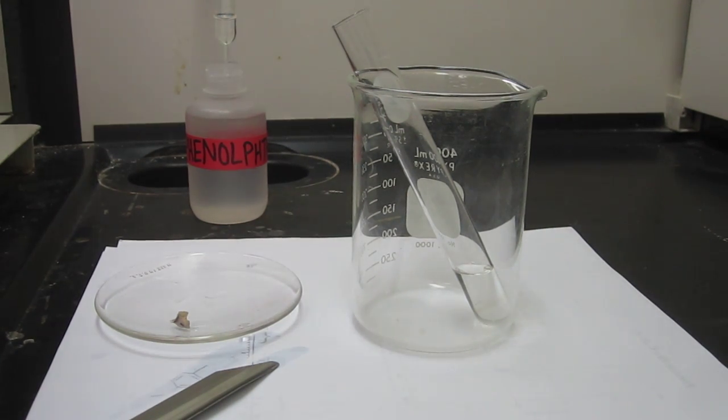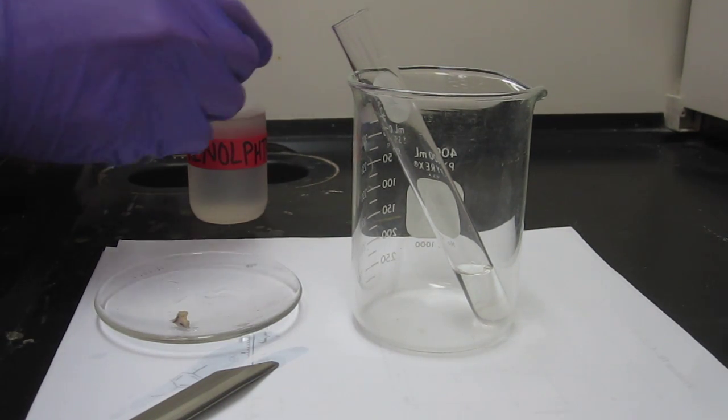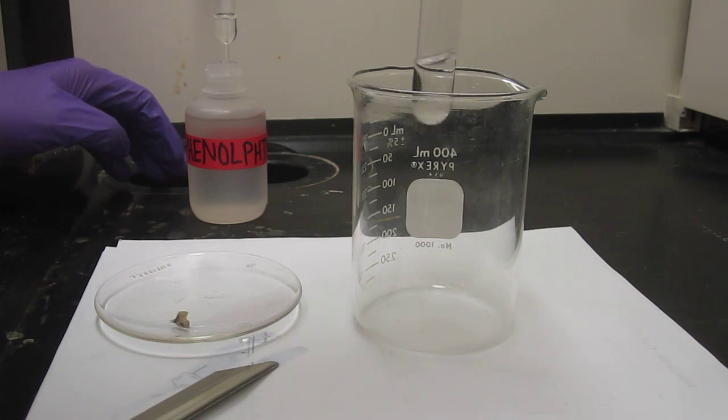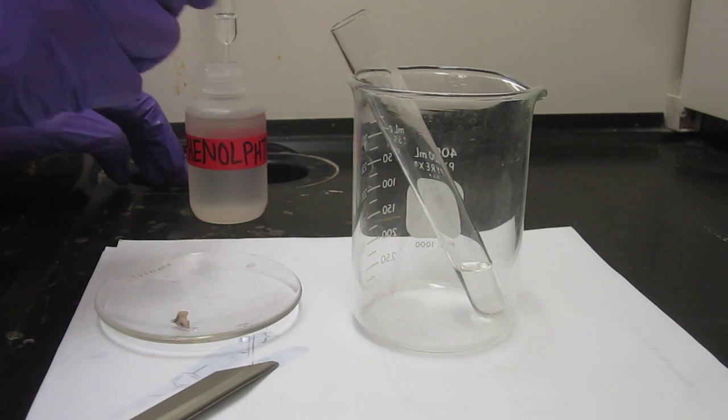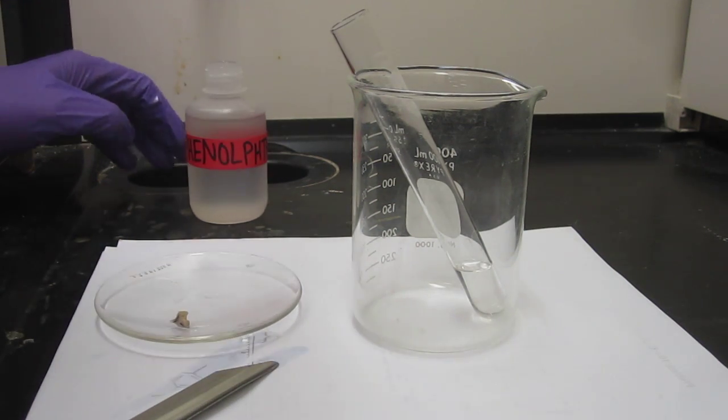Okay, so let's do the second of the two reactions. We have about two milliliters of ethanol in this test tube here, and we're going to put a couple of drops of phenolphthalein in there.